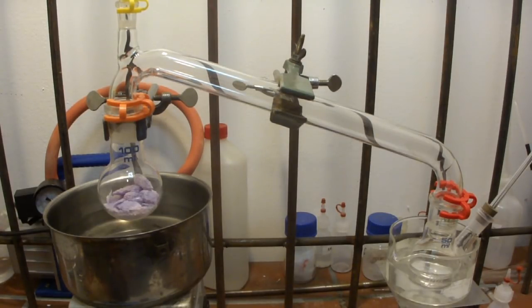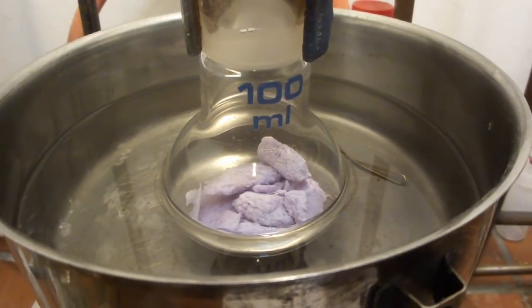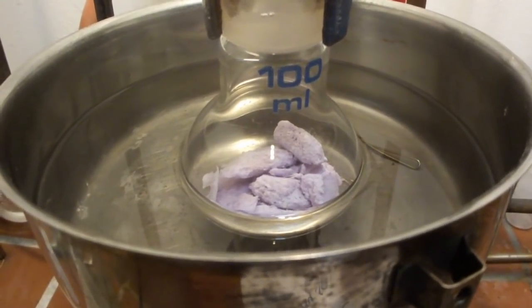So let's get started and let's see how we get on. Now let's raise the oil bath. So here's just another close-up of the trioxane in the flask.